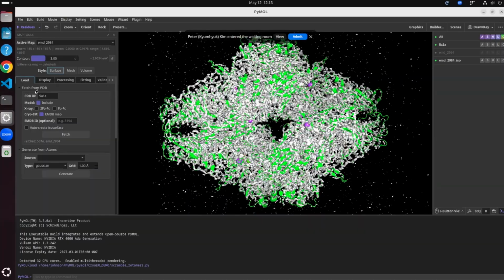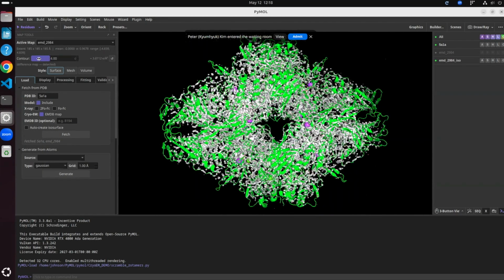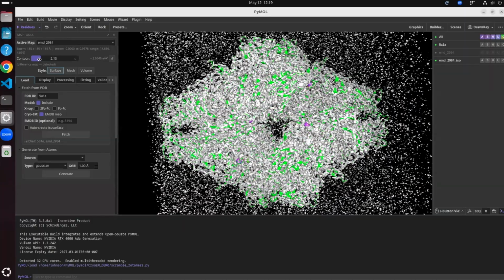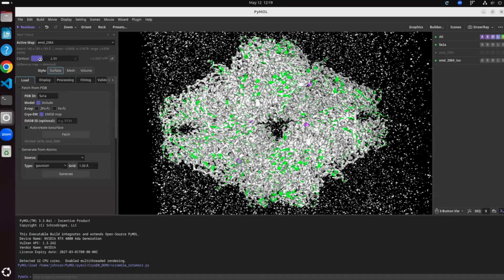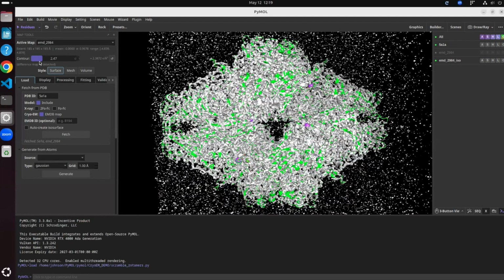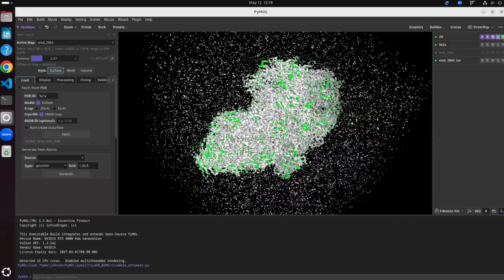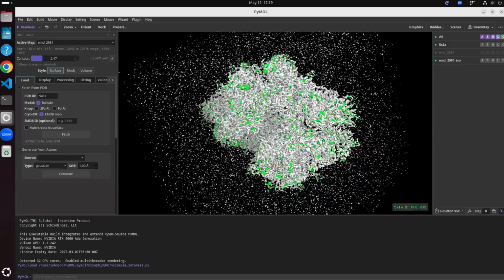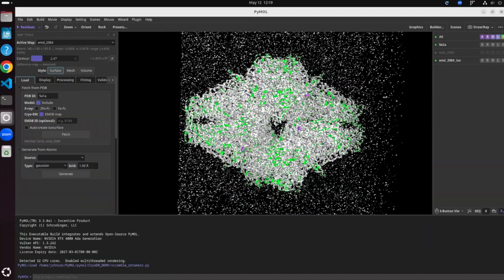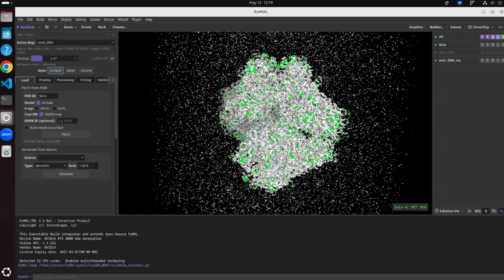The contour slider will basically show you the isocontour for this given surface. As you change the slider, you can see the surface mesh for parts that meet this iso level. And this is probably where I'll pause, so that I can show you some tools that you can use to remove a lot of this noise that comes from this map.